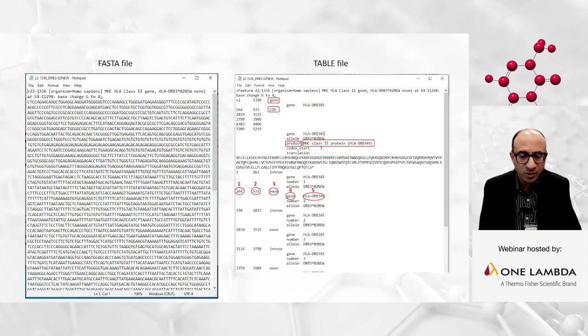You can do this table manually if you don't have this feature in your NGS analysis software. But I'm not going through these steps in this presentation, but I added a link here that can guide you on how to do this table manually.